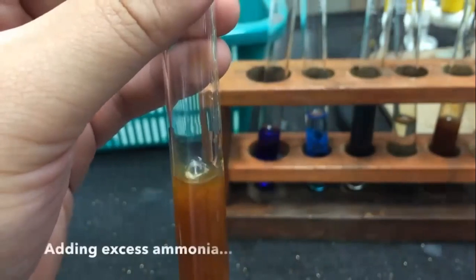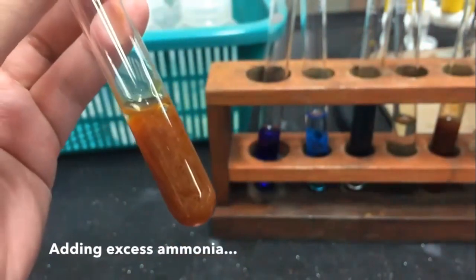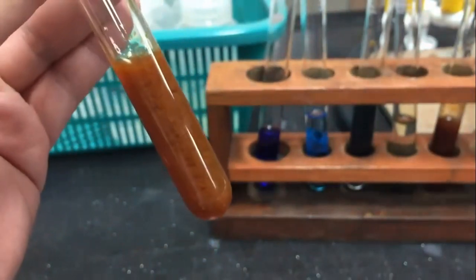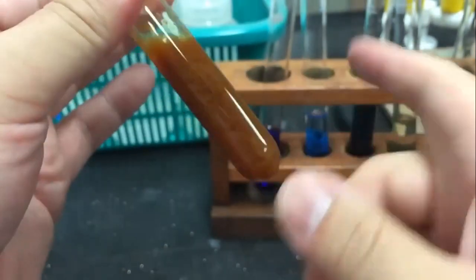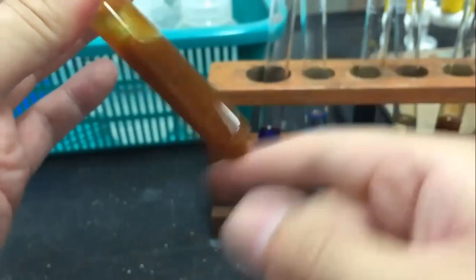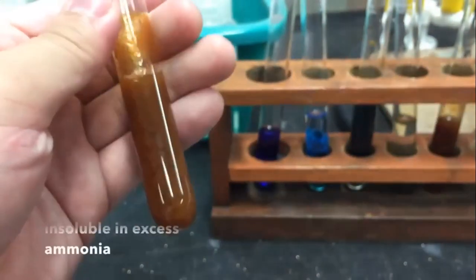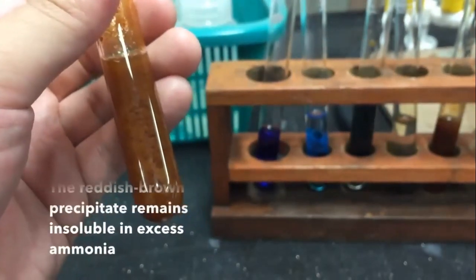Proceed to add an excess of ammonia solution into your test tube. Shake your test tube to ensure thorough mixing. Notice that the reddish-brown precipitate remains insoluble in excess ammonia.